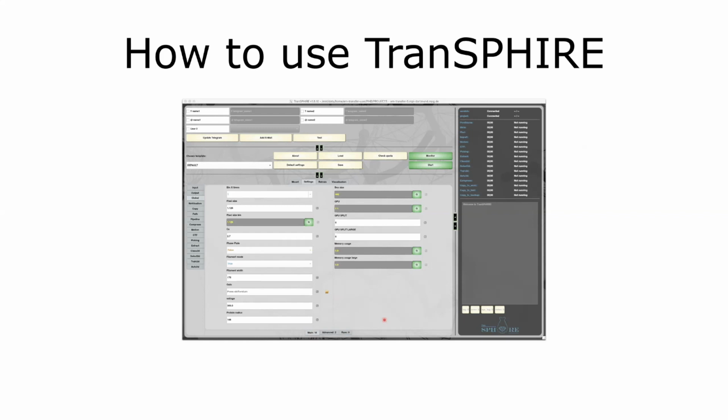We have a question on mounts, which you mentioned right at the beginning. Is there support for S3 or object store mounts for the archiving or the processing? So if people want to archive their movies up to AWS or to Glacier or whatever. So the mounting actually just works via a mount point, and then uses this output folder of the mount point. So this mounting option, in our case, we kind of do the mounting ourselves.